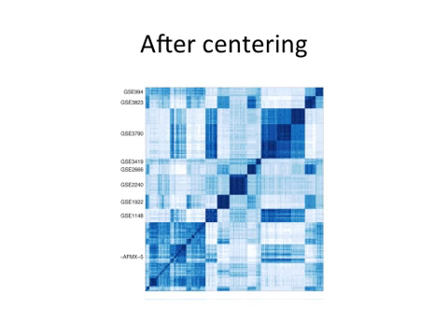If we think most genes are off most of the time, 0 will mean not expressed. And something like 3 or 4 or 5 will mean expressed. So once I standardize the genes and I recompute this correlation matrix that I showed you earlier, now we see a lot more white. Right? So now we see that many tissues, when you compare them to each other, actually have no correlation, which makes more sense. Now, we see these blocks.